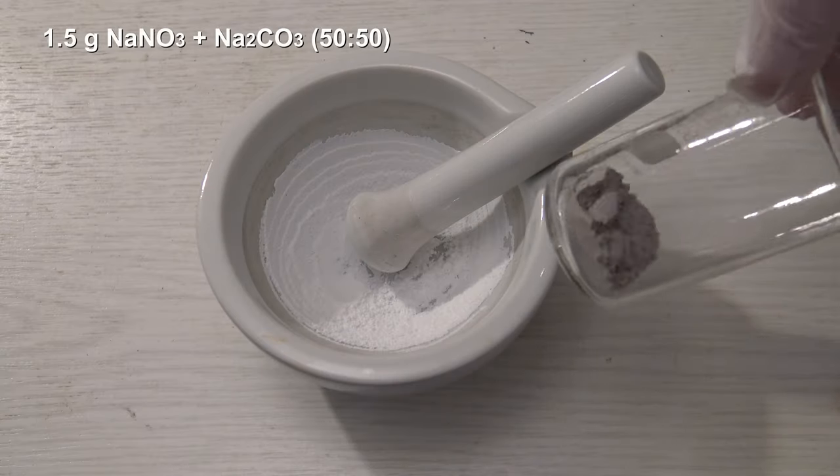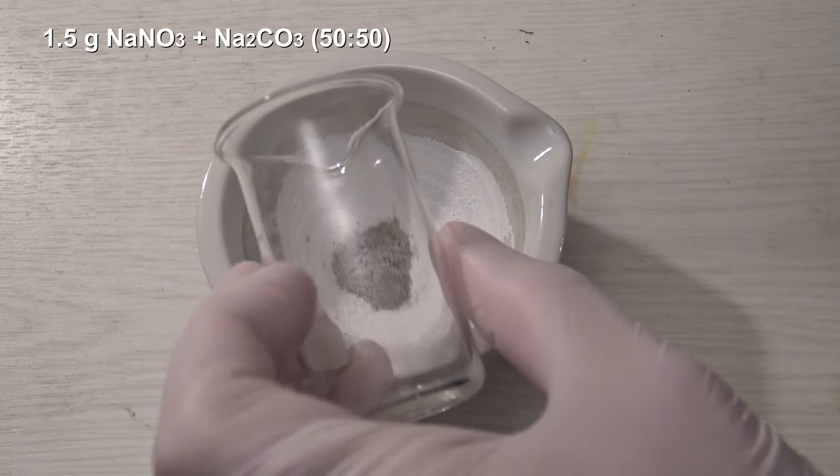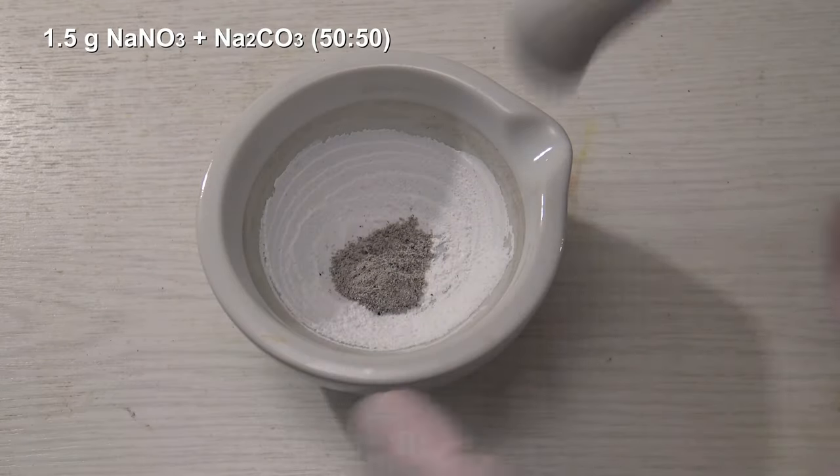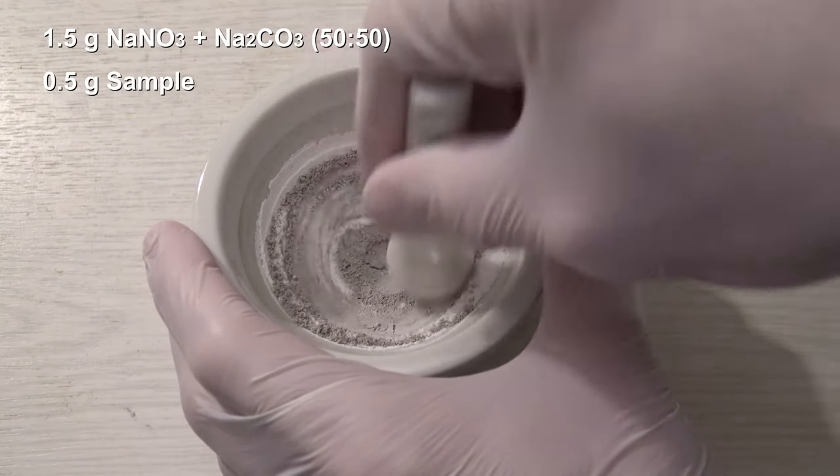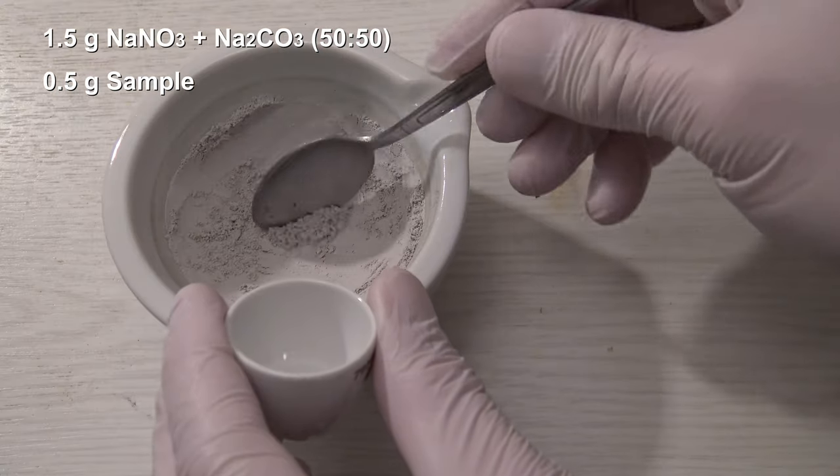Next, 1.5 grams of a mixture were already prepared in a mortar, which consists of same amounts of sodium nitrate and sodium carbonate. To this, 0.5 grams of the sample were added, the mixture crushed again and transferred to a porcelain crucible.